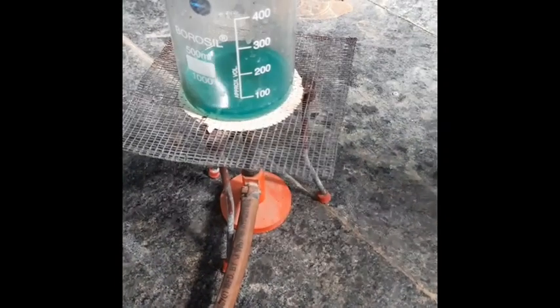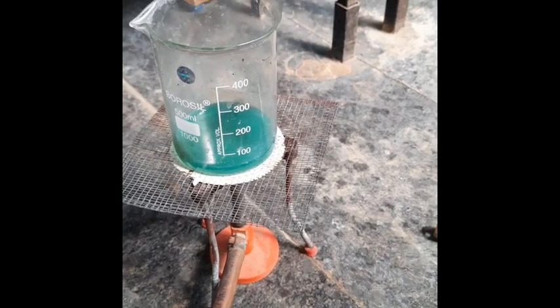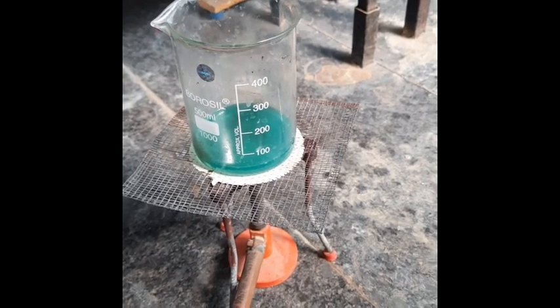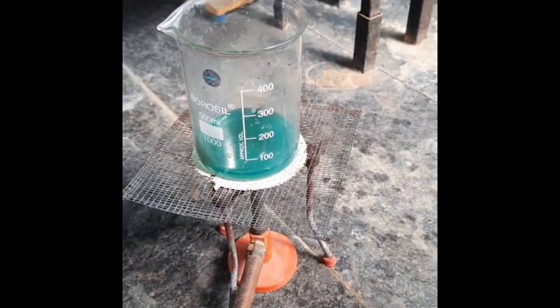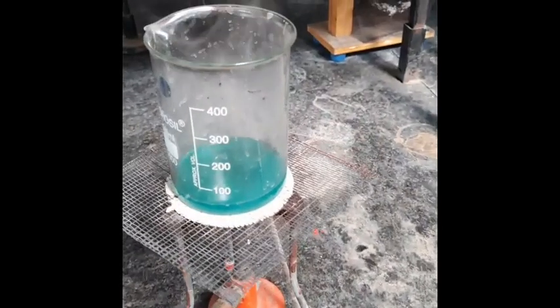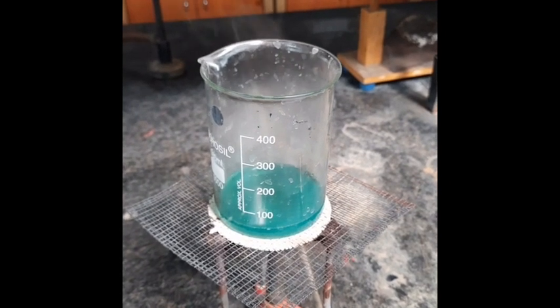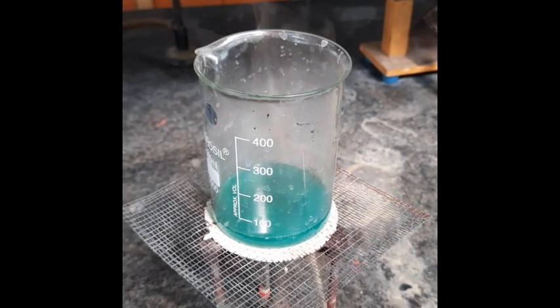Keep the wire gauze and heat it. See, you can observe the white fumes which are evolving out. We have to heat till all that white fumes are evolved. See, till white fumes are coming out. Heat it for a few more minutes.